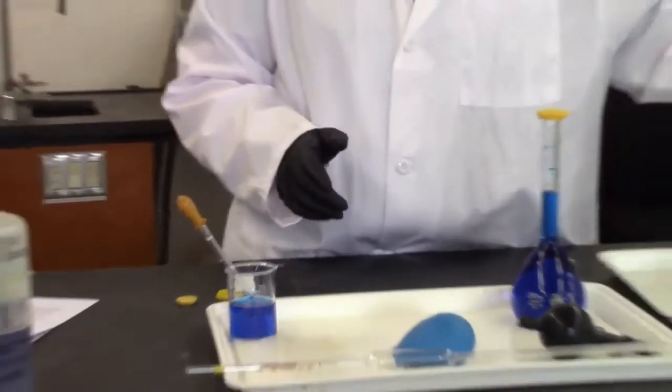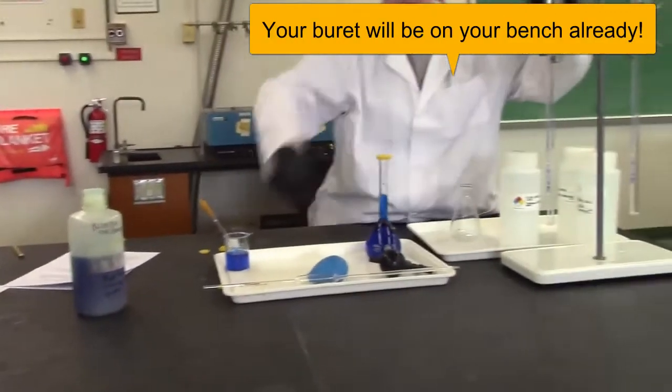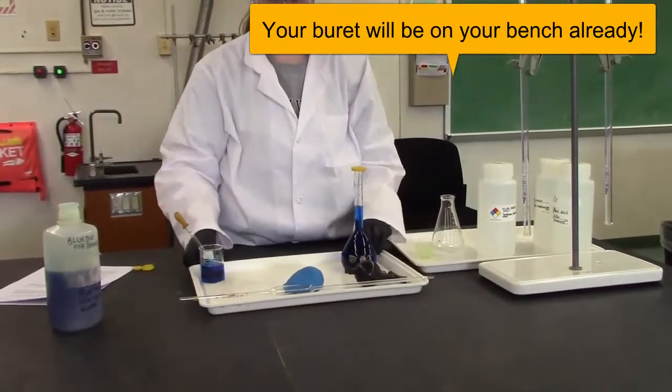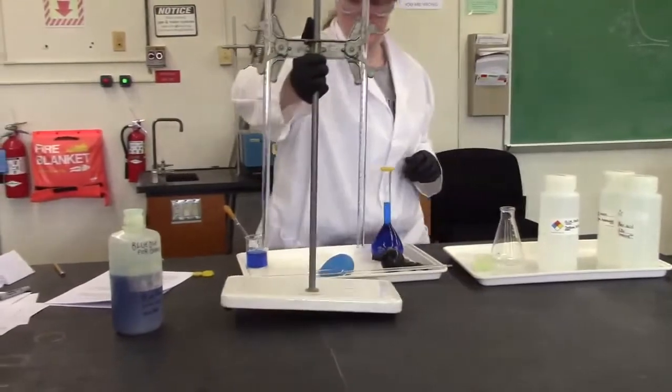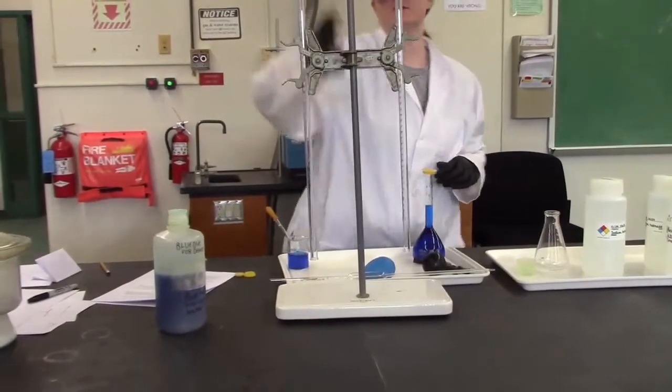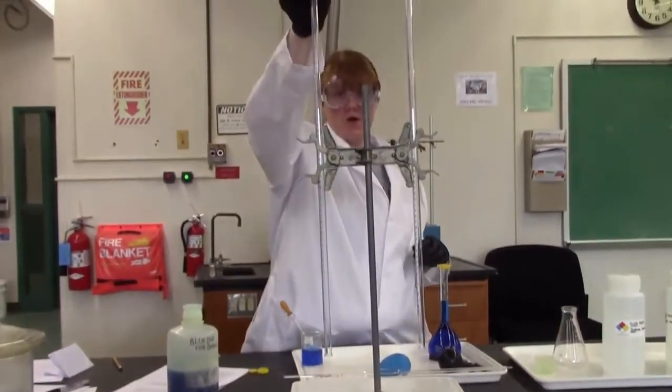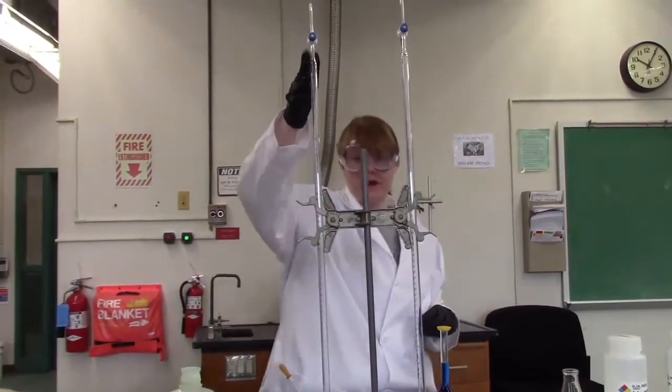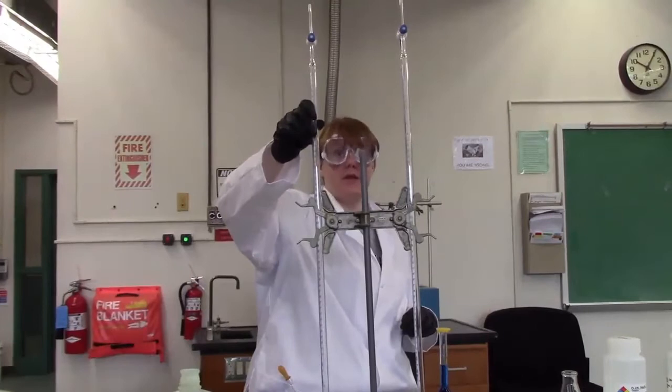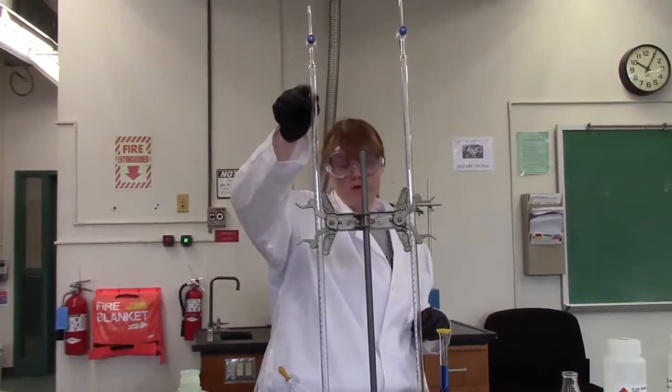The first thing we have to do is prepare a burette. The burettes are located on the side bench near where you usually pick up your chemicals. They're stored like this, upside down with the stopcock open. That's because when you finish you want to clean it and then leave it to dry thoroughly. If this is closed it doesn't dry very well.